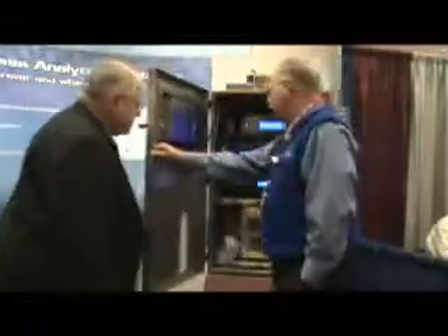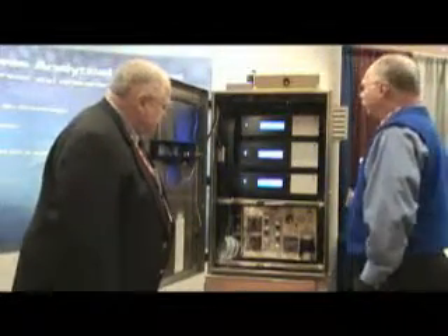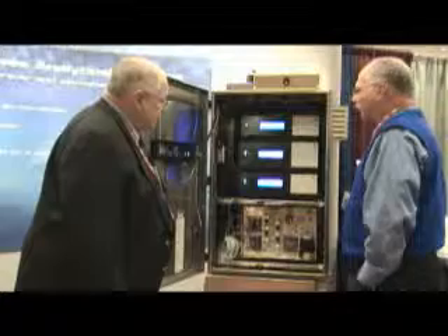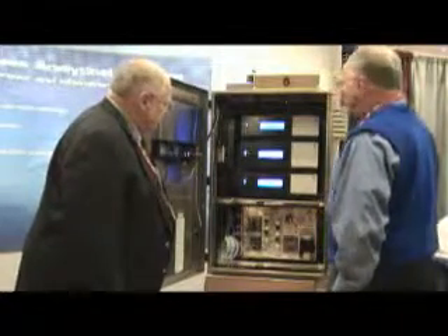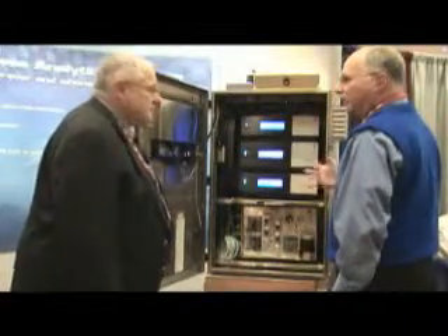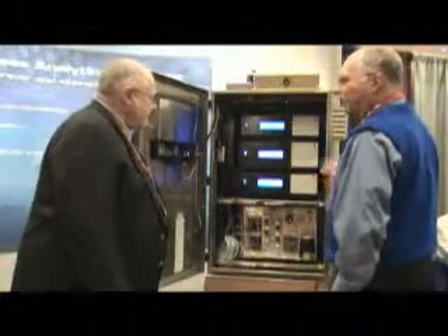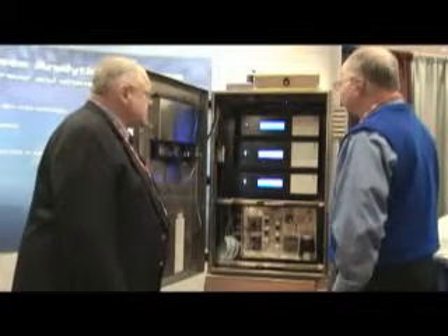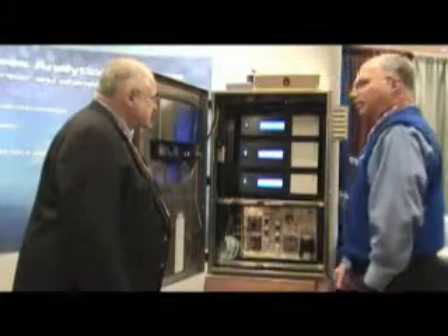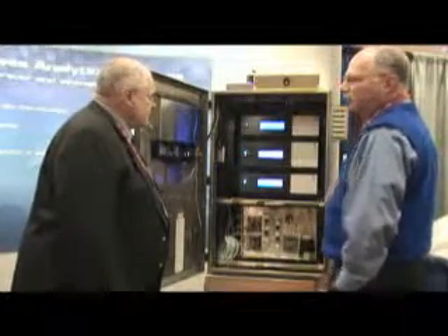The system is configured to utilize any of our HPLC or IC instrumentation. The models we provide can be configured as single or dual channels — so not only can we do one assay, we could do two assays either in parallel for faster results, or complementary assays like an anion and cation assay for high-purity water in an IC configuration. We could also set it up for two-dimensional LC — for example, capturing monoclonal antibodies on a protein A column, then eluting them into a reverse phase column for reverse phase separation.